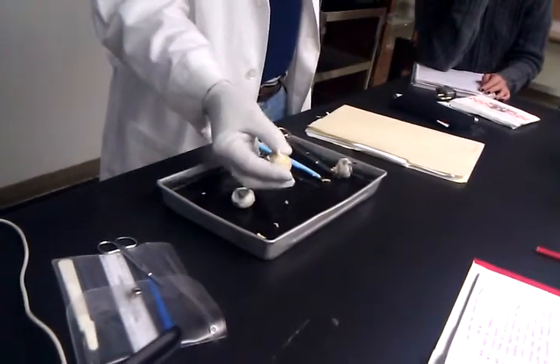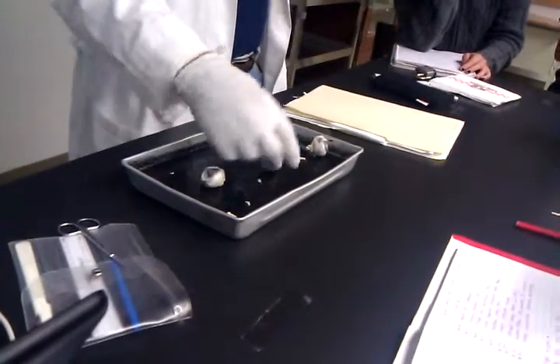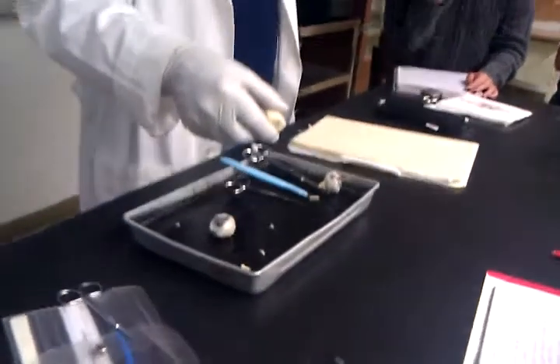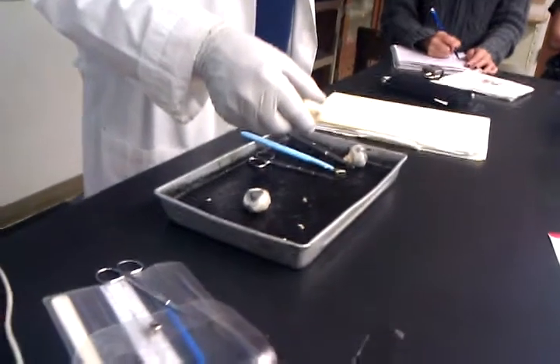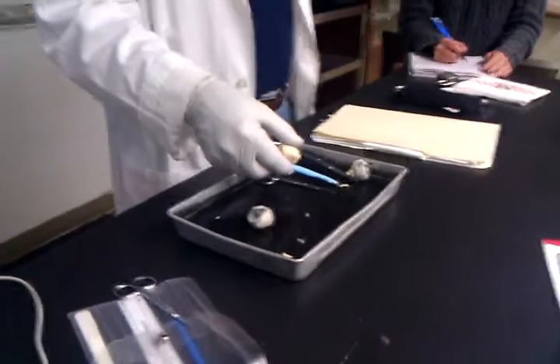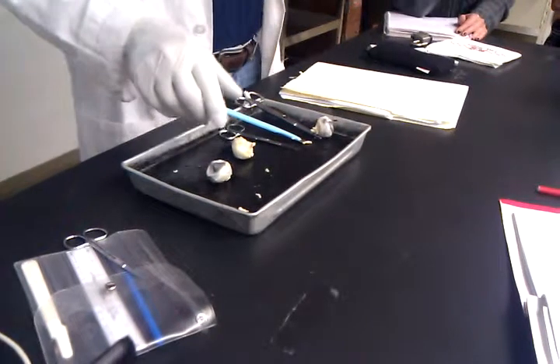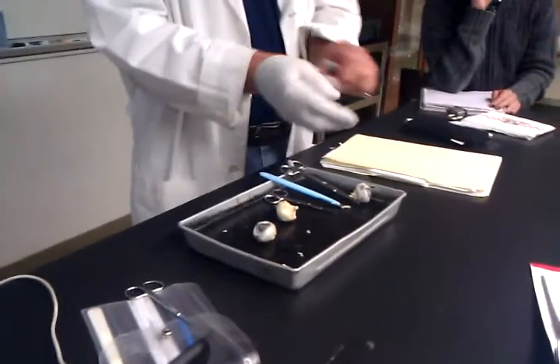But if you turn it around, you can see this big stem, like you can pick it up by it, right? This big stem back there is the optic nerve that emerges from the back of the eye. I was trying to describe where the blind spot would be. So if I could stick a pin straight through the optic nerve into the back chamber of the eye, if I did it exactly perfectly, it would come out at the blind spot.